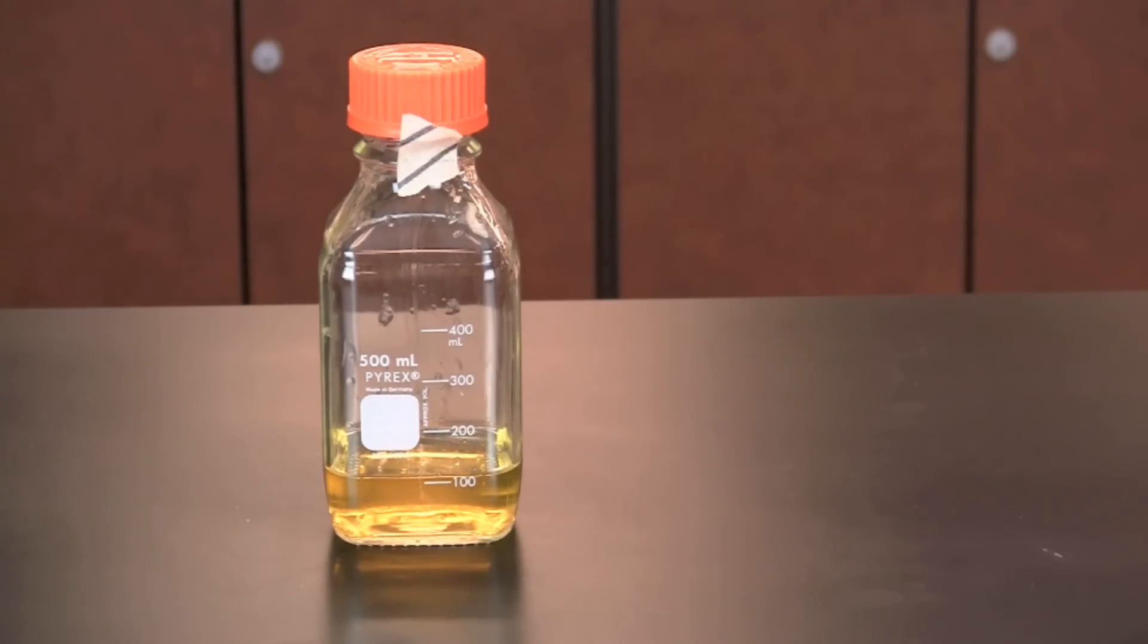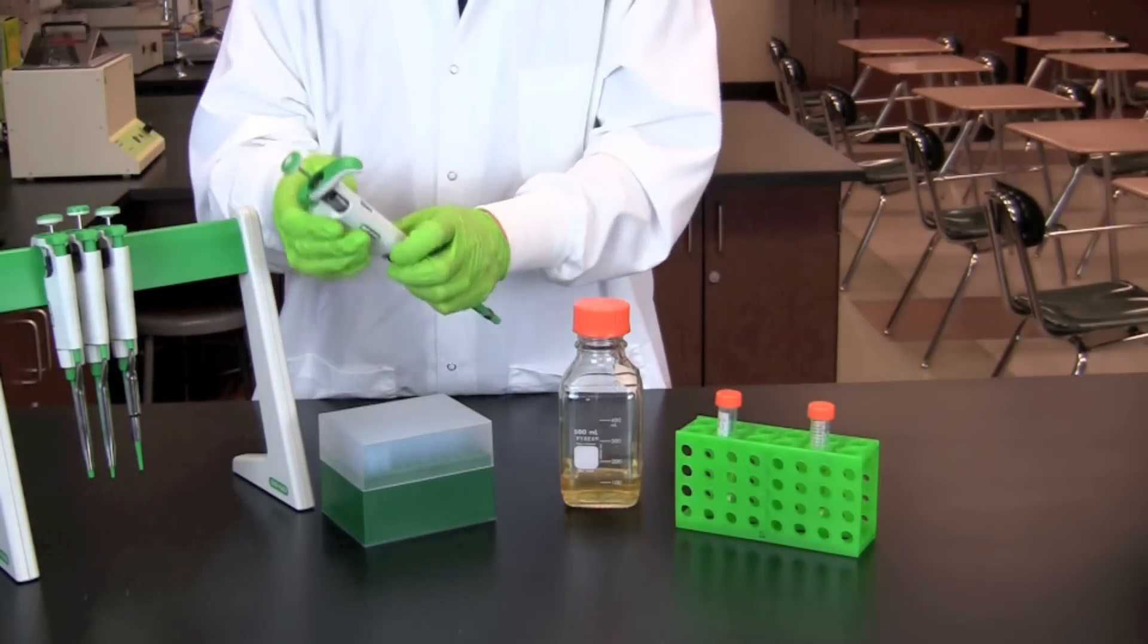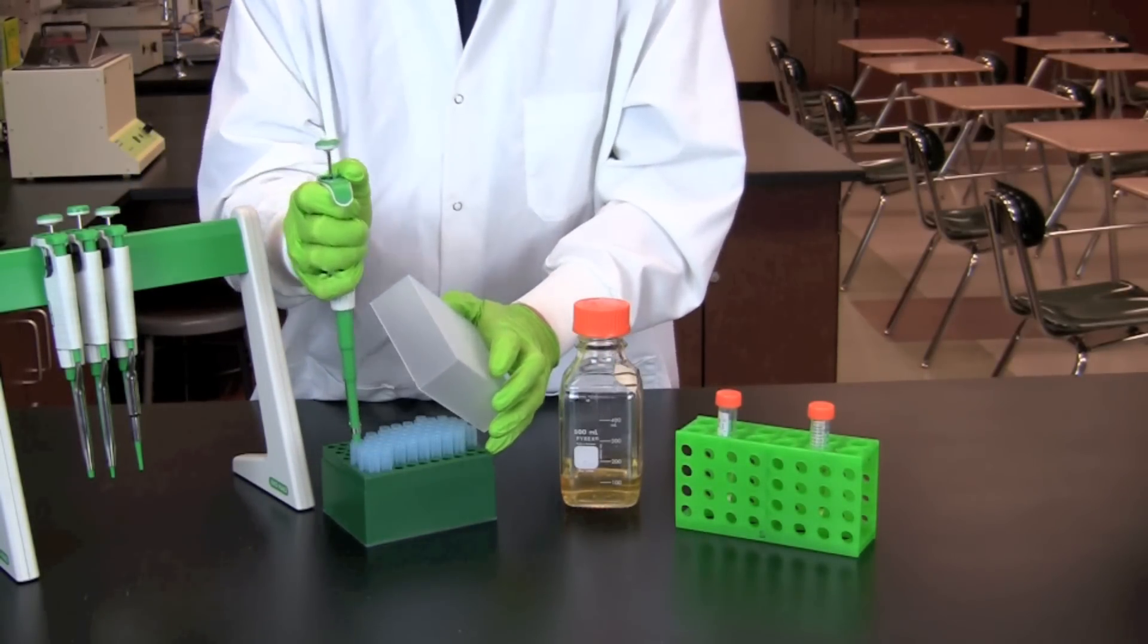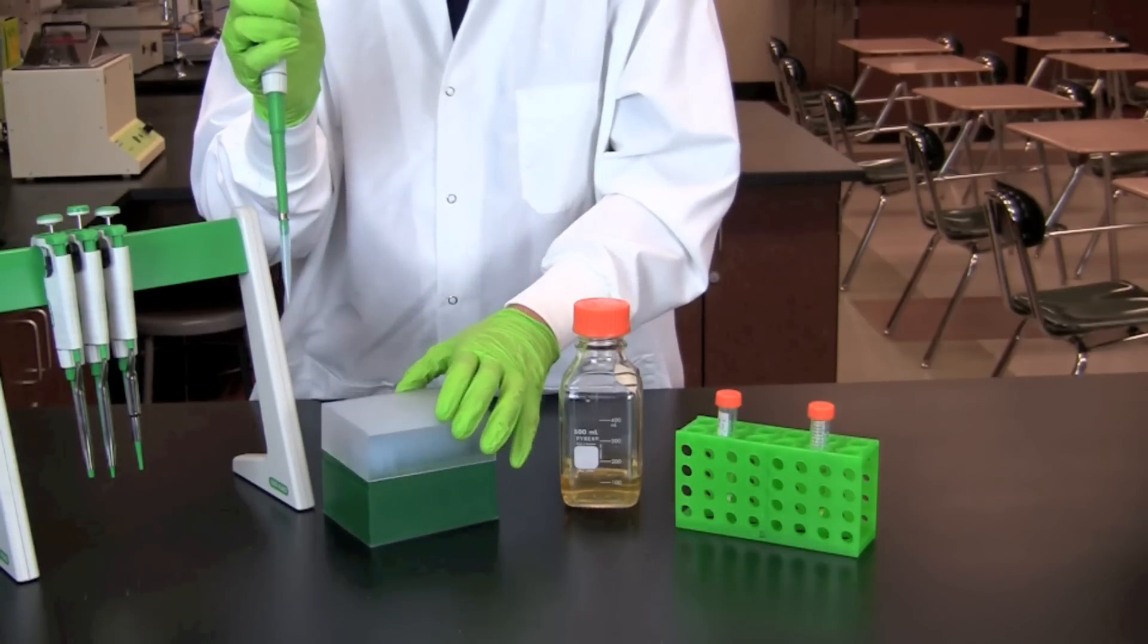After taking the media out of the autoclave, allow the media to cool to 55 degrees Celsius prior to adding ampicillin. Ampicillin is destroyed at temperatures above 60 degrees Celsius. Set your pipette for the volume of antibiotic prescribed in your lab protocol and transfer that volume to your media.